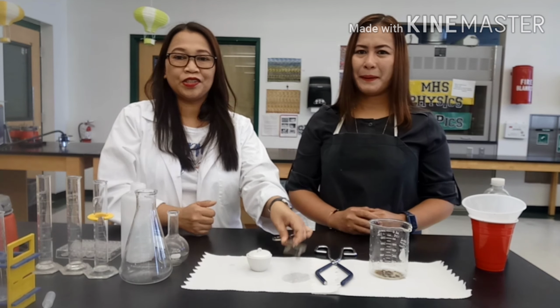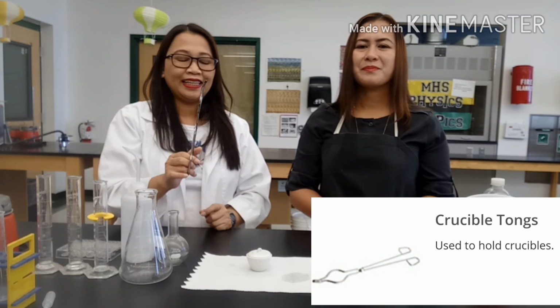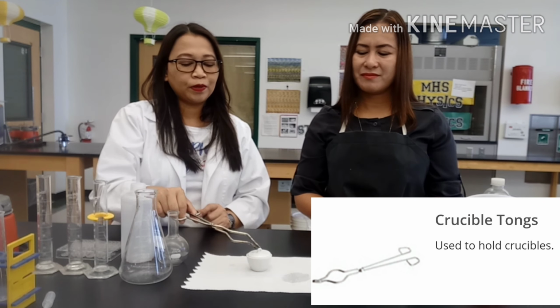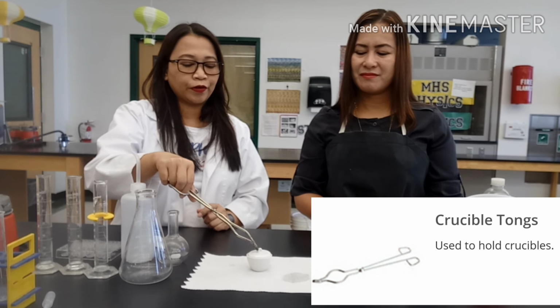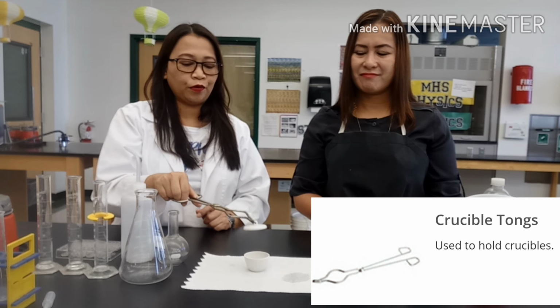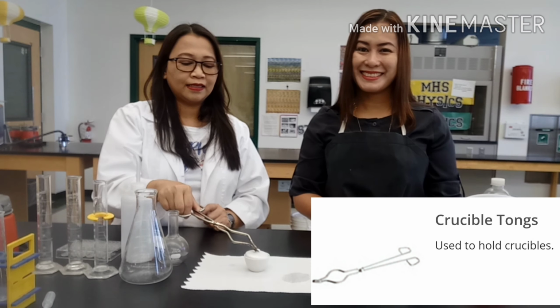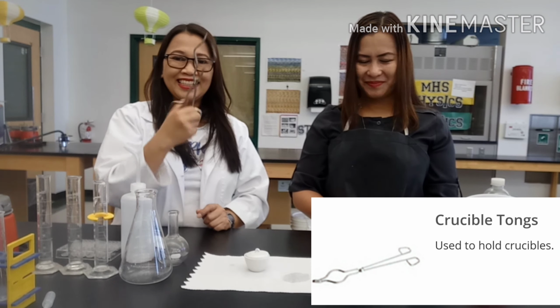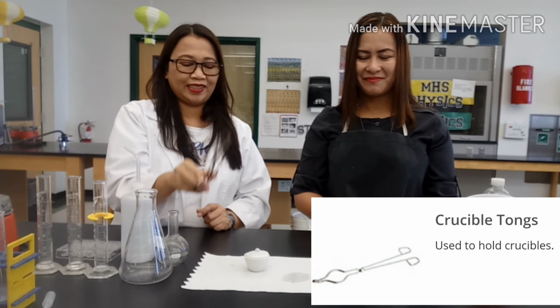So this one is your crucible tongs. That means we're going to use this for the crucible and cover. For example, if you want to open the cover of your crucible, you use the crucible tongs like this, and you return it like that. So you still use the crucible tongs. All right, so this is the crucible tongs.